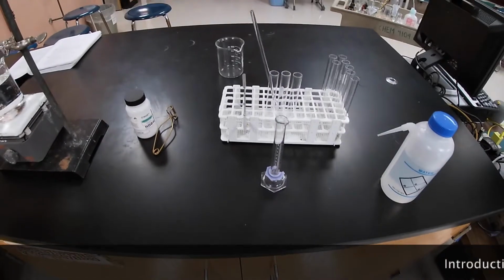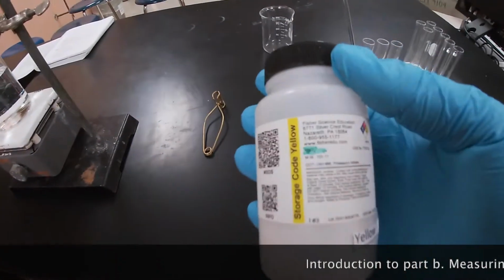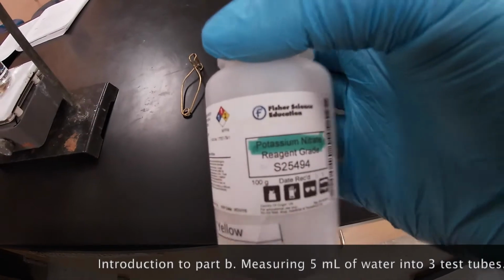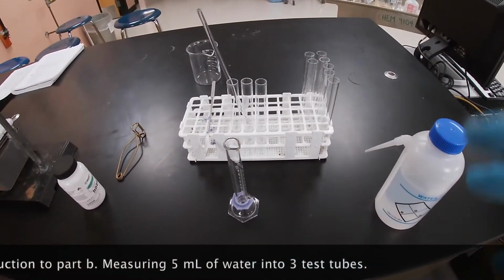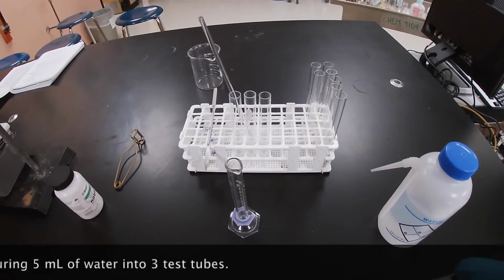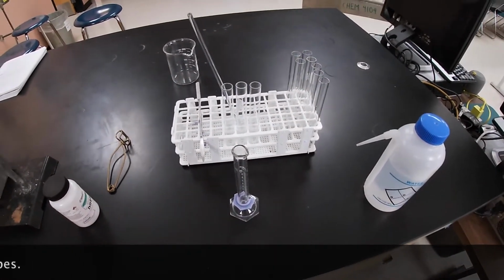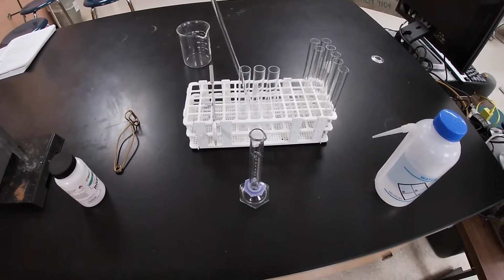The first thing we're going to do for part B is the solubility of potassium nitrate. Here, as you can see, we have a substance of potassium nitrate. First we're going to measure out, and I'm going to try to see if I can get at least 3 value points in. In theory, each lab was supposed to do a specific mass, and then from there we share data and develop our solubility curve for potassium nitrate.